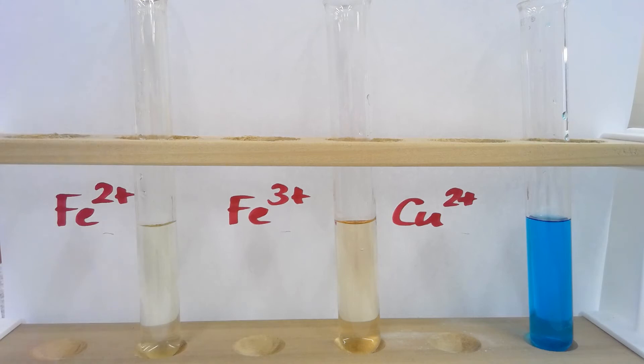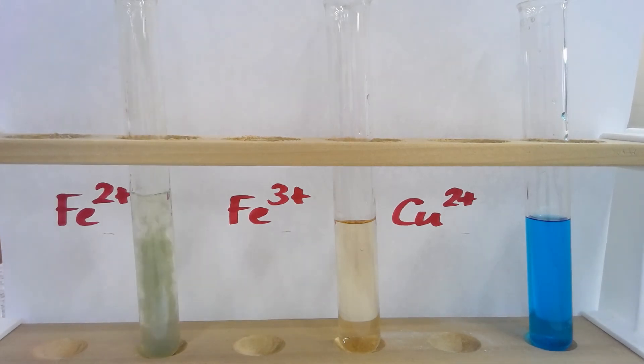What I'm going to do is add some sodium hydroxide solution, and we should end up making some colored precipitates. First of all, the Fe2+, and as you can see, we just made a green colored precipitate.